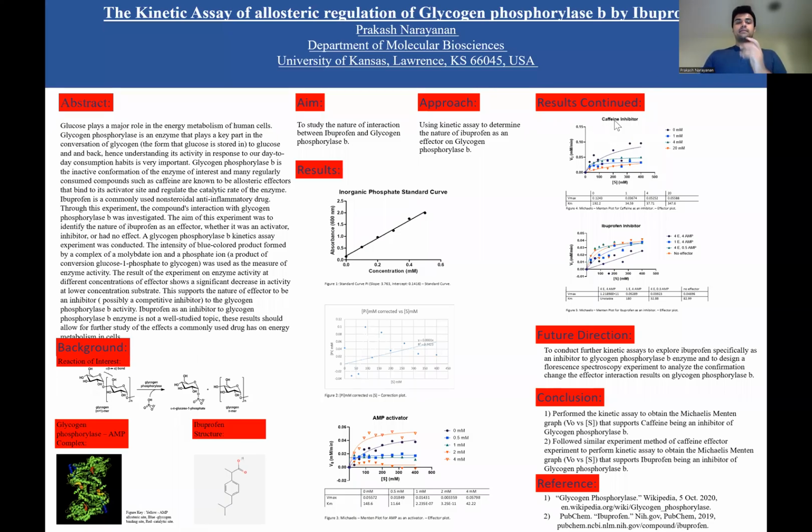My poster and experiment is about kinetic assay of allosteric regulation of glycogen phosphorylase B by ibuprofen. My experiment is a part of Biology 639 Advanced Biochemistry Laboratory. I was mentored by Dr. Roberto Guzman from Molecular Bioscience Department.